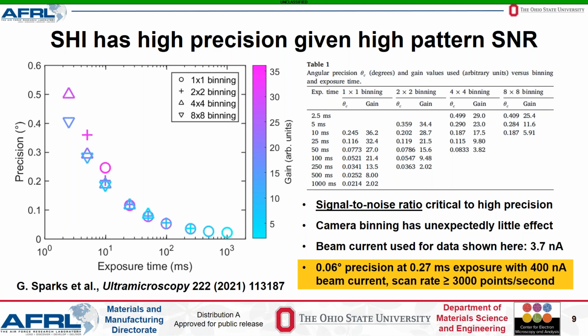I should, however, note that while the orientation precision is good, the massive increase in beam current will increase the size of the interaction volume and therefore decrease the spatial resolution of the scan. As our current experiments use scan point spacings on the order of 1 to 2 microns, the decrease in spatial resolution was not a major concern for us. However, others wishing to resolve finer features may need further experimenting to determine the trade-offs between the beam current and the spatial resolution.